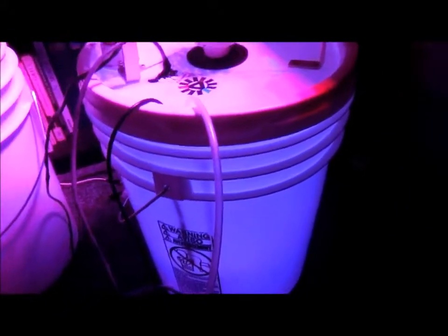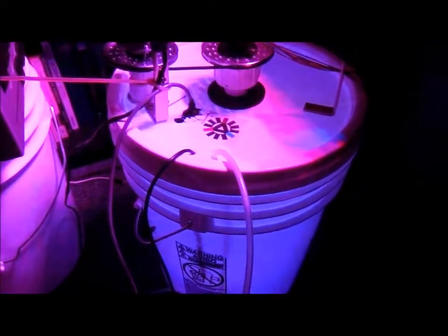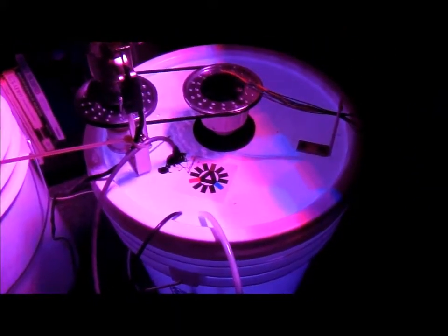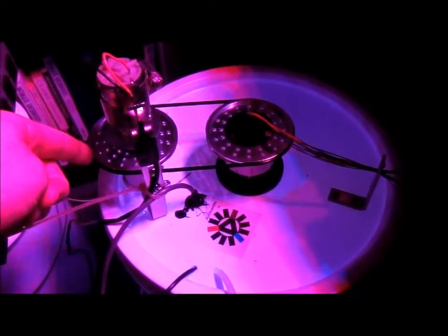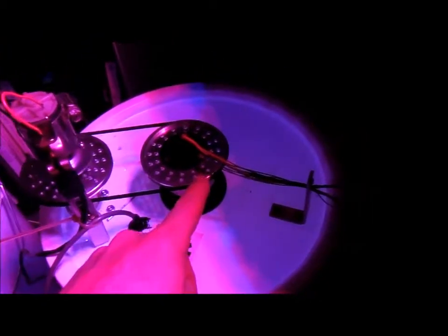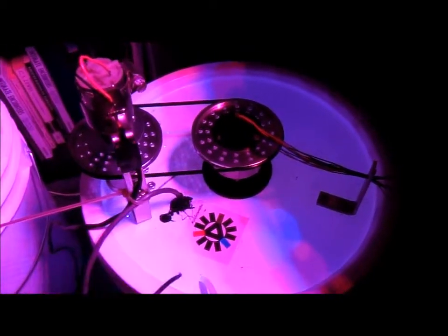This unit here is the photobioreactor, and that's just a fancy name for a grow unit for algae that's controlled. And what you have here is a DC motor going to the sprocket pulley, and then the rubber band in between. This will rotate so that this item here will rotate.